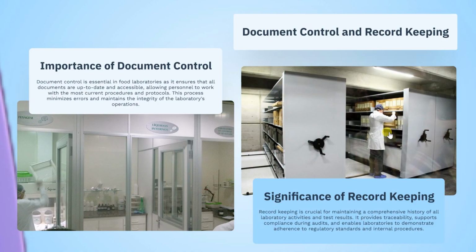It's very, very important. Now, the significance of record keeping is crucial for maintaining a comprehensive history of all laboratory activities and test results. It provides traceability, supports compliance during audits, and enables laboratories to demonstrate adherence to regulatory standards and internal procedures.